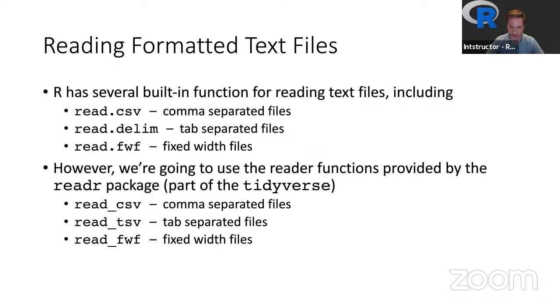From more simple data files like CSV files to more complex ones like complex mass spec formats like MZML files, for example. And there are usually functions, sometimes coming from different packages, that allow you to read these kinds of data files into R. We're going to focus simply on reading CSV files. These are comma separated value files that represent data tables. One of the easiest things to work with, and actually lots of data is represented in CSV format, so it's a very common format to use.